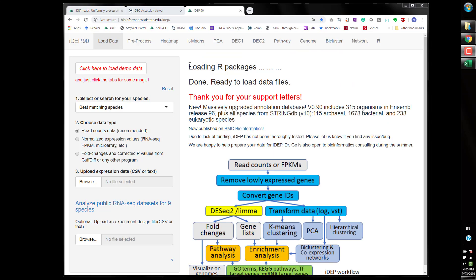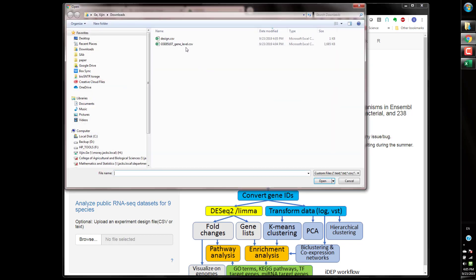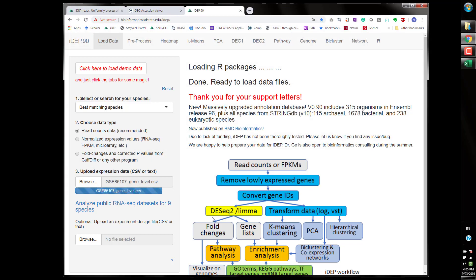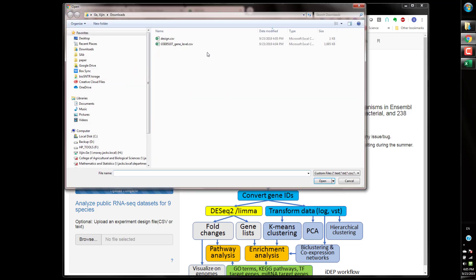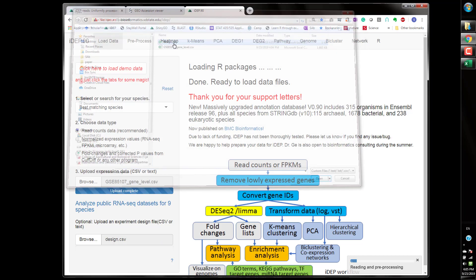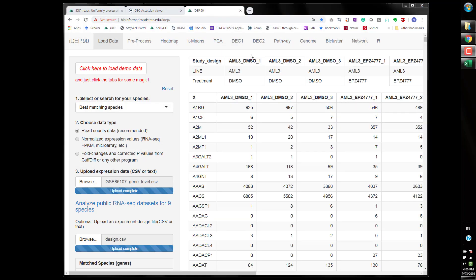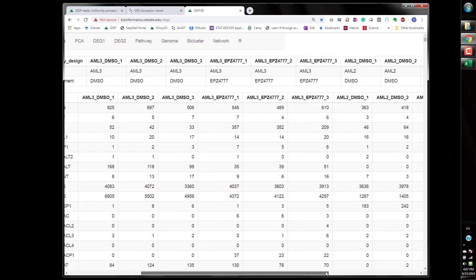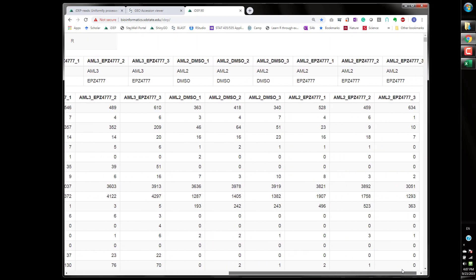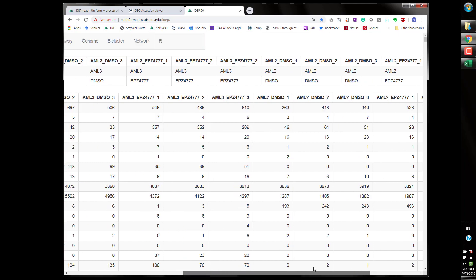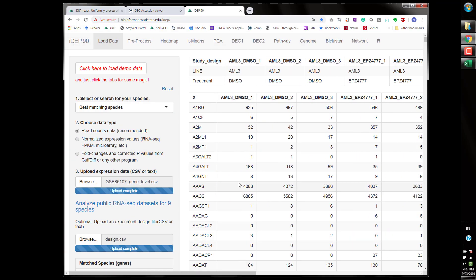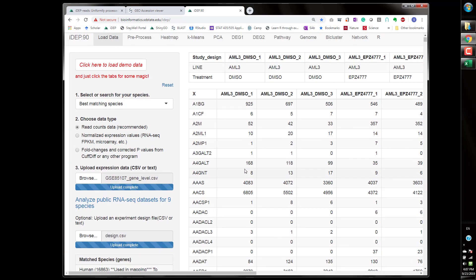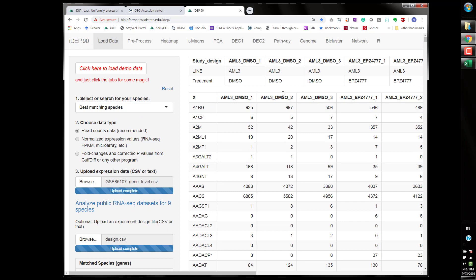The iDEP website and read counts data obviously and then we browse to get this gene level counts up and load in the experiment design. Sometimes people get error messages if the sample names don't match between the expression matrix and the design file. As you can see I just copy and paste the same thing.